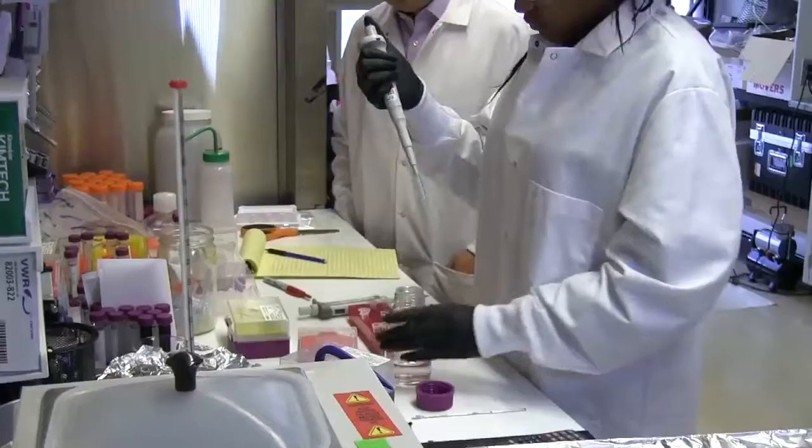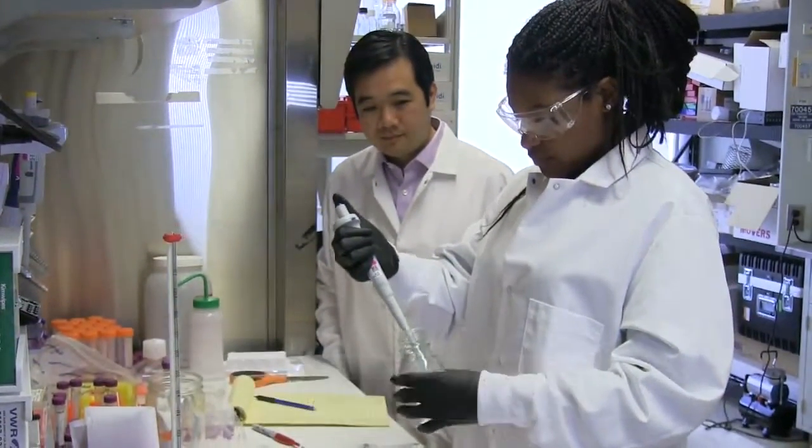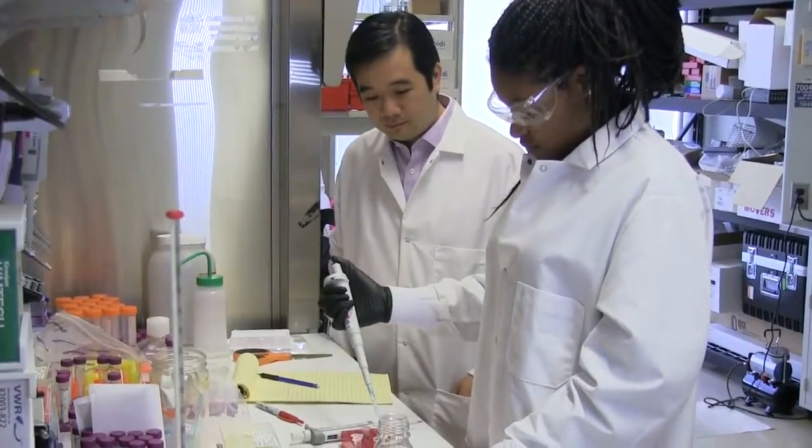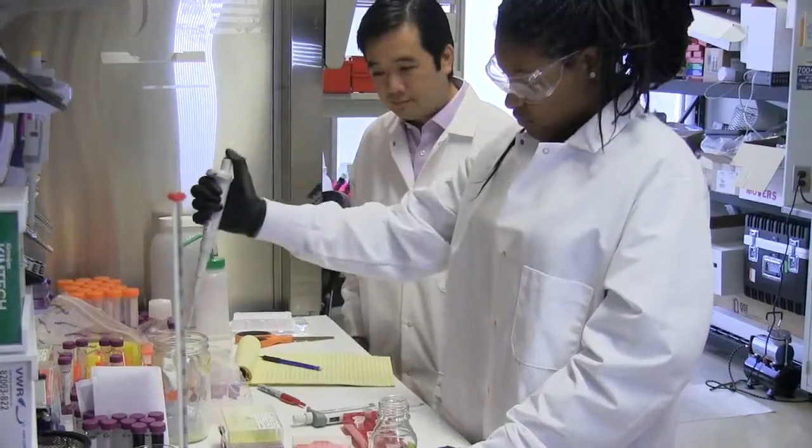I'm Kayla Holloway. I'm actually making nitric oxide and hydrogen peroxide sensors. So it's basically DNA wrapped single wall carbon nanotubes. So I'm going to be detecting hydrogen peroxide and nitric oxide in different cells. So the first two things I'm doing is actually synthesizing two different types of DNA.